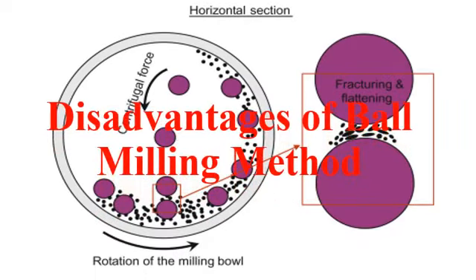So now let's discuss, students, what are the possible disadvantages of the ball milling process. What do you think? What could be the disadvantage of the ball milling process?